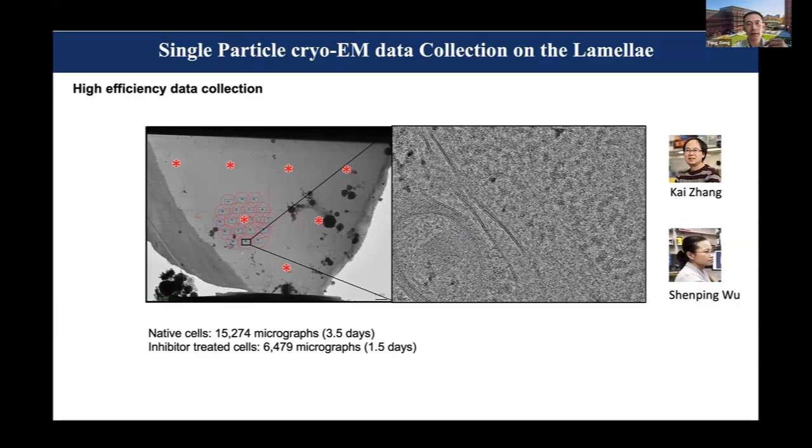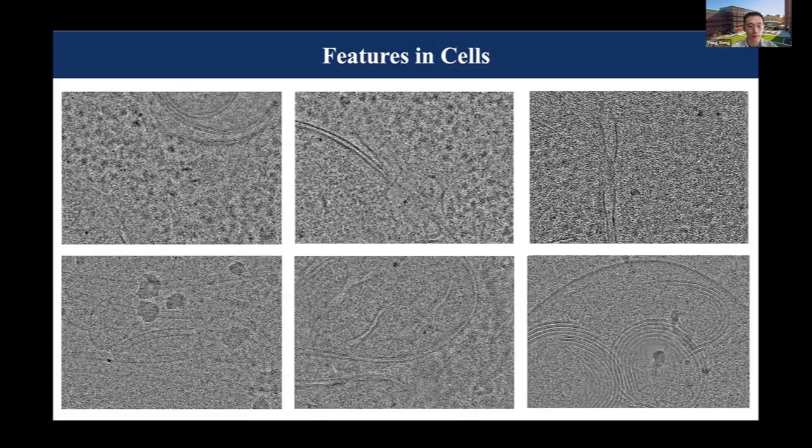And then this is a small gallery of micrographs of different parts of the cell. As you can see, down in the middle is a piece of mitochondria. Then upper right is a nuclear pore complex. And on the bottom left, you can see lots of microtubules, all the cell features. But we focused our first study on, if you look at the top left, the 2 micrographs, those black dots, which are perhaps the lowest hanging fruit inside the cell. Those are the ribosomes.